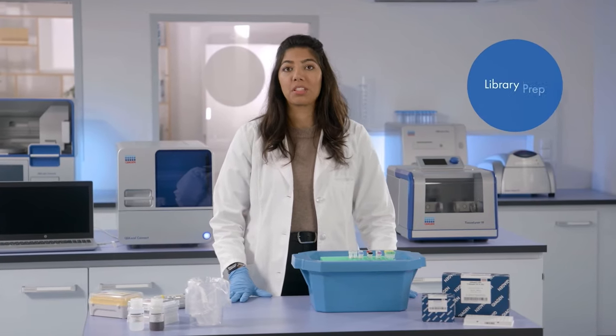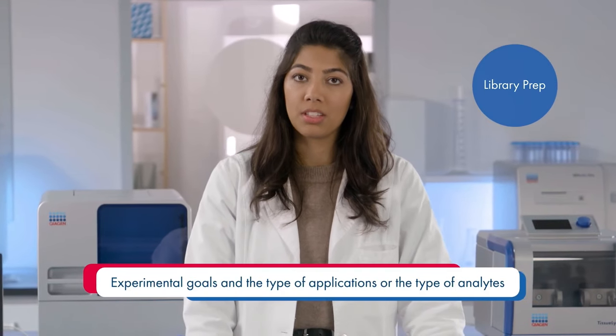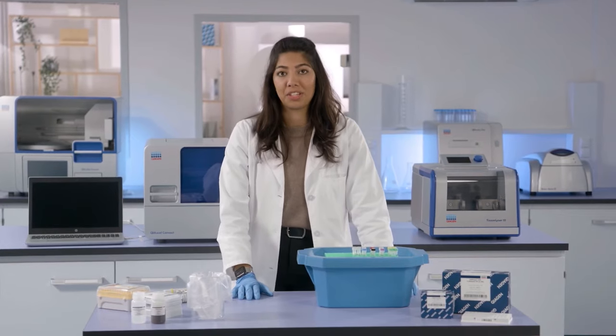Before you start your library prep, you must select your library prep method based on factors such as experimental goals, type of applications, and type of analytes. For example, the choice of method depends on whether you're planning on performing whole genome sequencing or exome sequencing. You also need to consider the amount and quality of your sample.